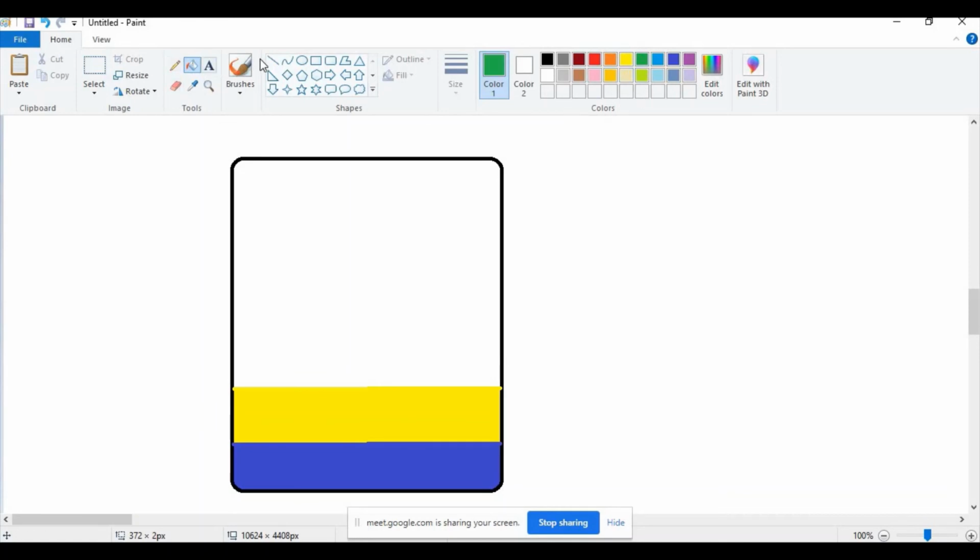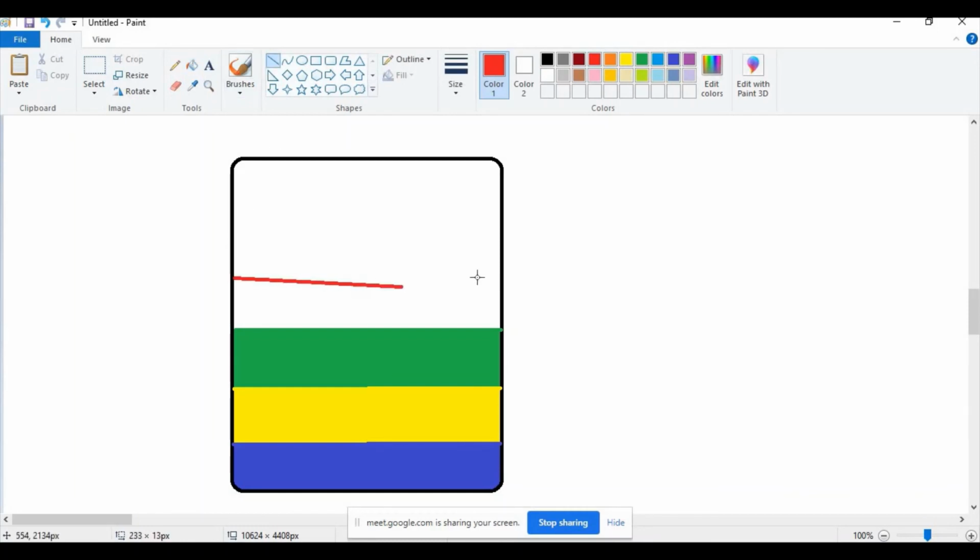The concentration is still less. Now I am putting different colors, but this is the same sucrose solution having different densities. Likewise, I have again added another batch of sucrose solution having a different density.